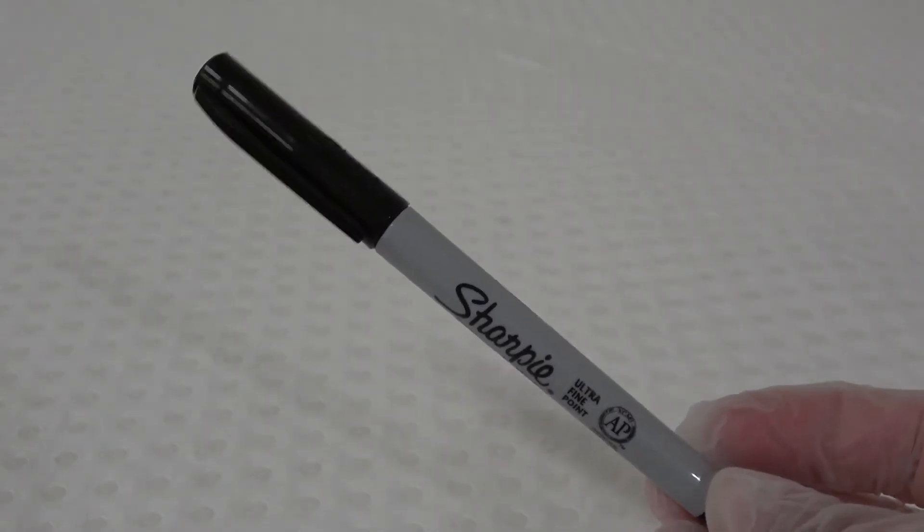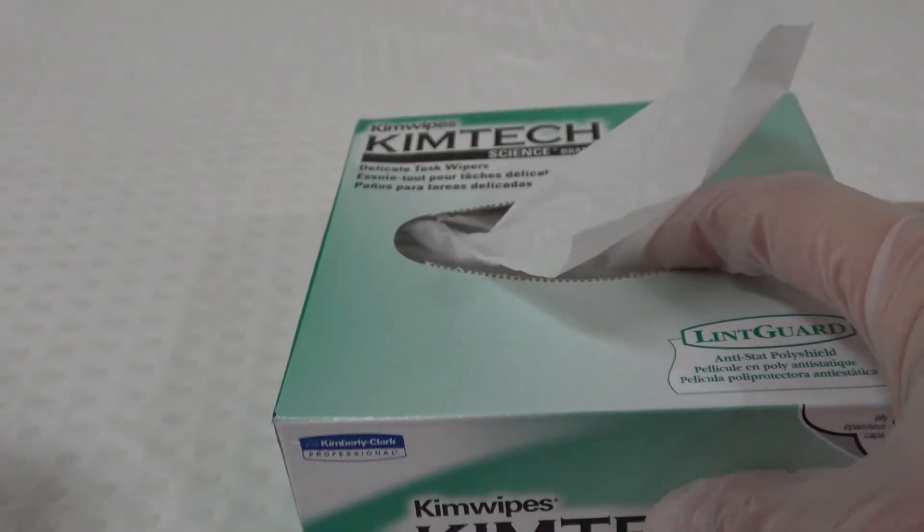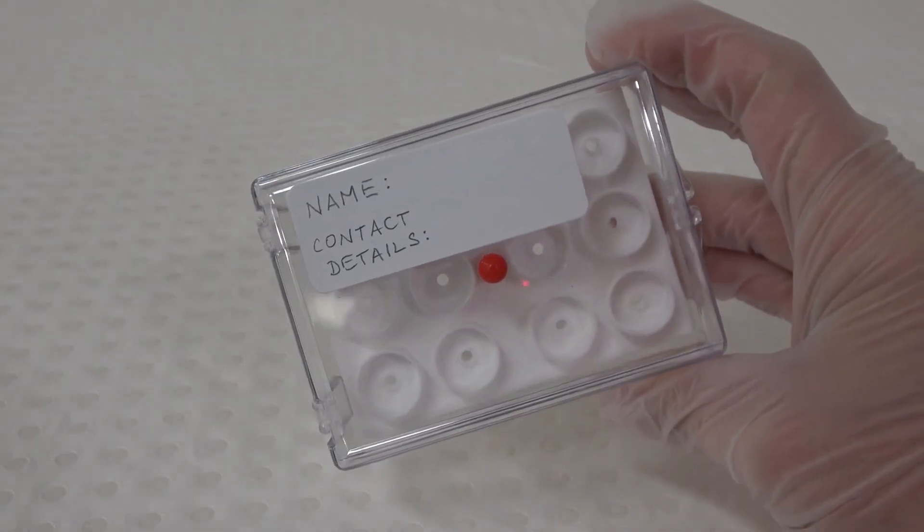A small spatula. A fine permanent marker. Gloves. Foil or low lint lab tissue. And a SEM sample storage box.